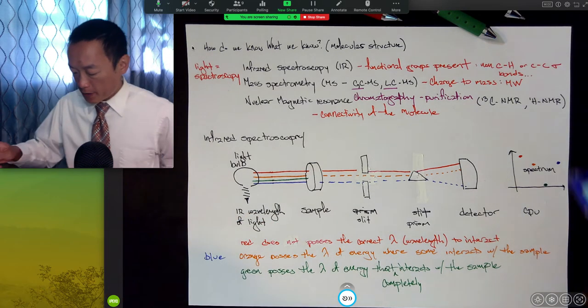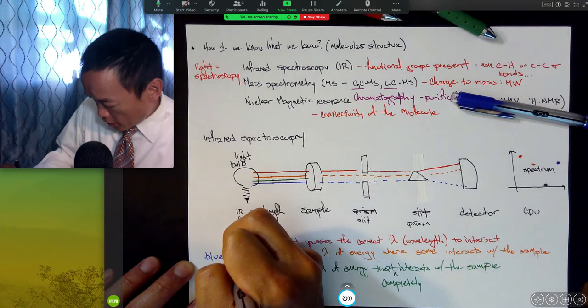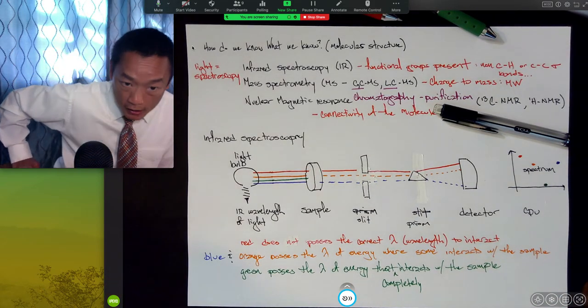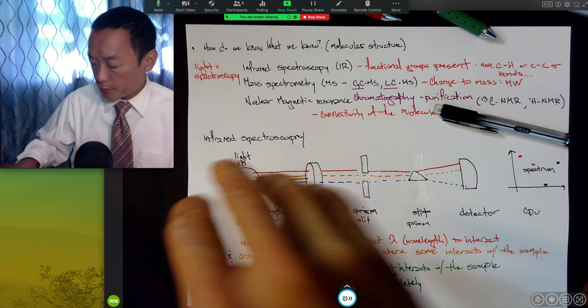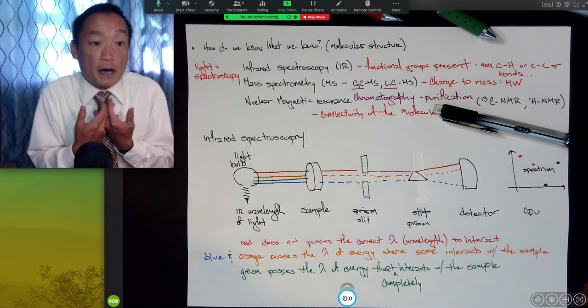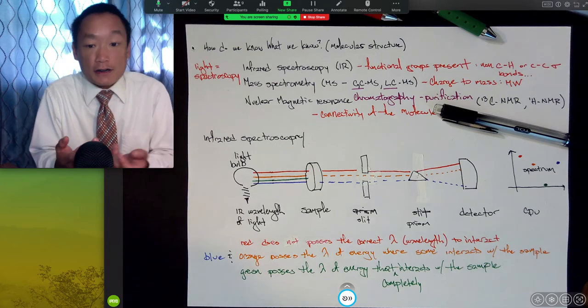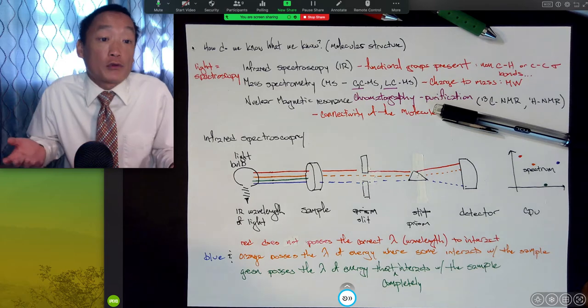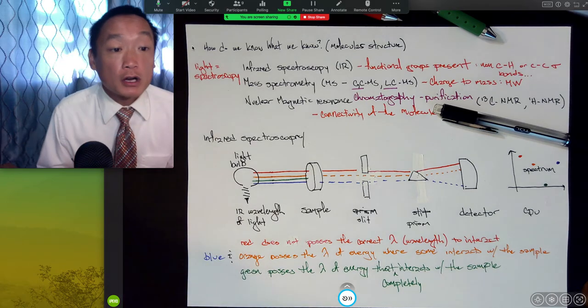That's what's happening inside the instrument when you tell it to take a sample. And so light goes on, boom. Some of the light is absorbed by the molecule. Some of the light is not. Red was not absorbed. Orange, some of it was absorbed. Green, all of it was absorbed. Blue, some of it was absorbed.